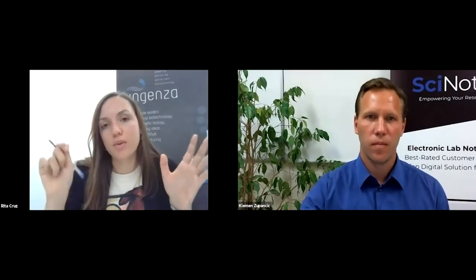It's a mixture of two things. For some specialist equipment, we have a Google Calendar, and we use that. And for simpler equipment like incubators, we have a piece of paper stuck to the equipment that you can write on, and people will come in and book it for the next week or something. So having something integrated in SciNote would be great.